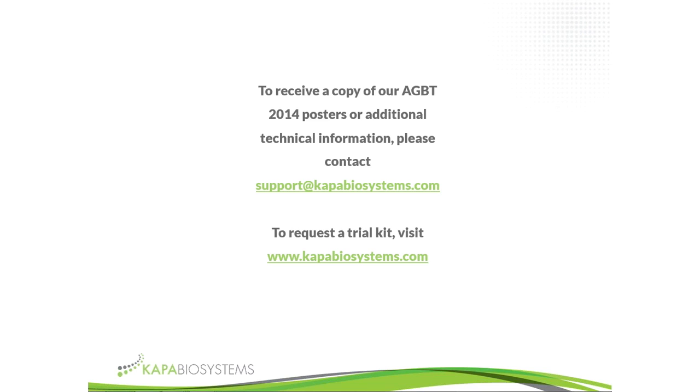Excellent. So do others continue to use a PicoGreen assay or Qubit if they use the human genomic DNA quantification and QC kit, and how can I use both assays to get the most info? Yes, so many labs still continue to use a Qubit or a PicoGreen assay. I think the one doesn't replace the other.